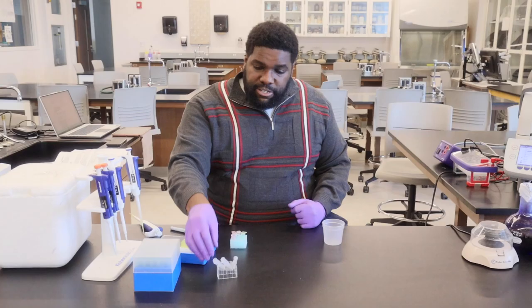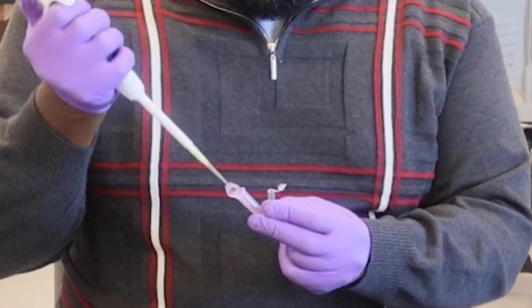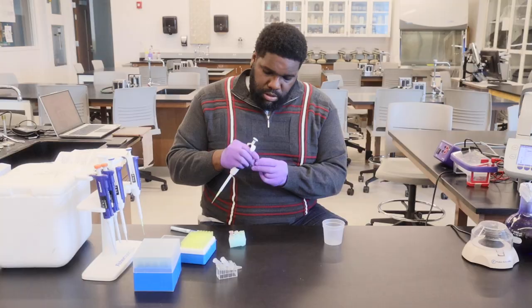So first we will add in our DNA sample. First, from the crime scene, we'll do 20 microliters of our DNA sample. Make sure to quickly cap your Eppendorf tube.